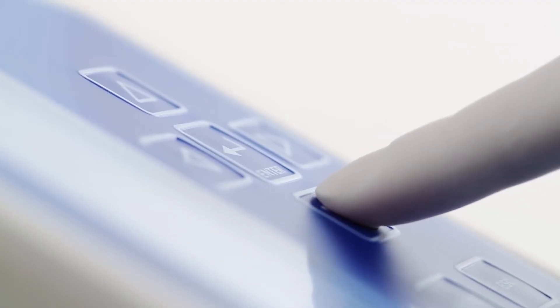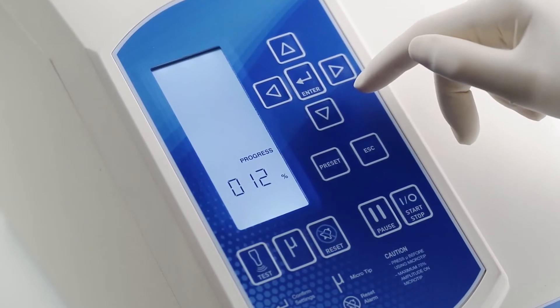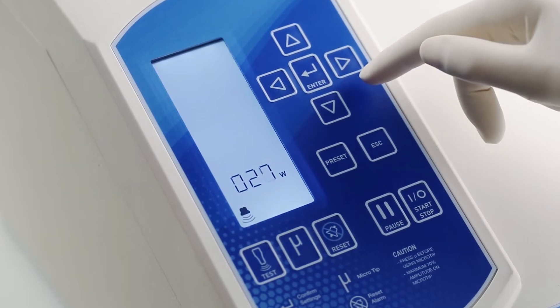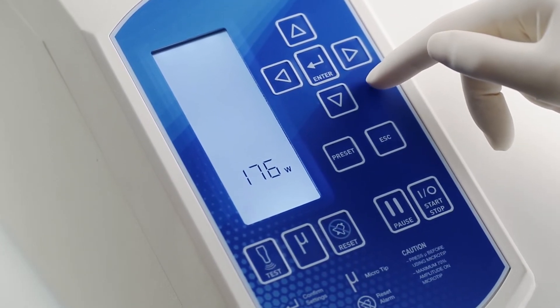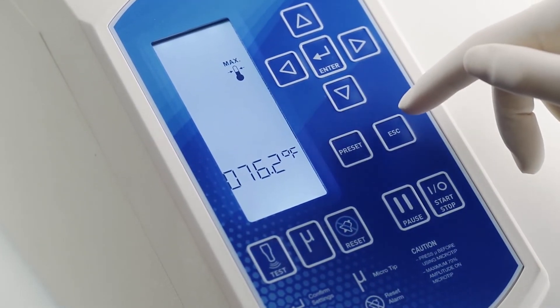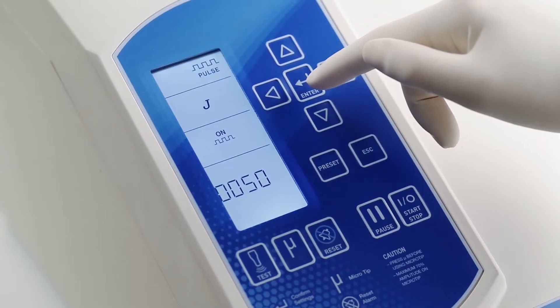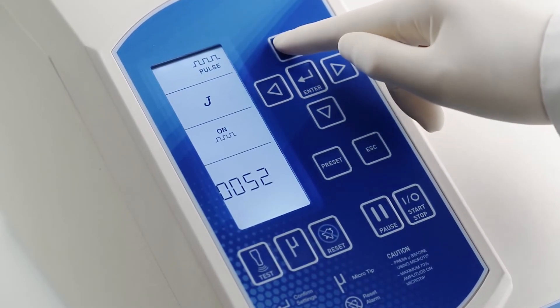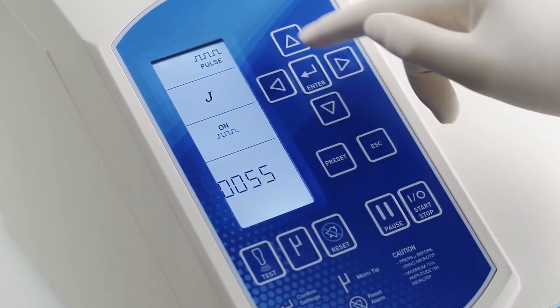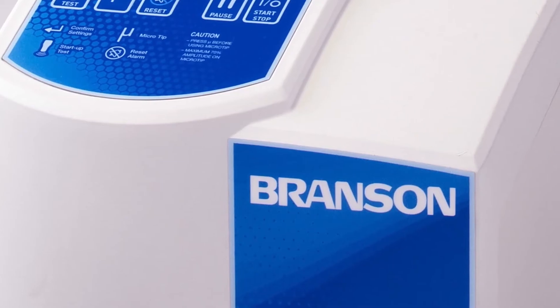And the SFX series provides more control than has ever been possible before. You can see the amount of energy being applied to your sample at a glance. You can even specify not just the time, but the precise amount of energy to be applied to the sample. Only the Branson SFX series allows you to control this critical variable.